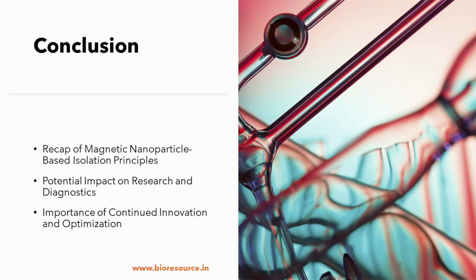So in the area of diagnostics, MNP isolation holds a promise for developing rapid point of care tests for detecting infectious diseases, genetic abnormalities, and environmental toxins.